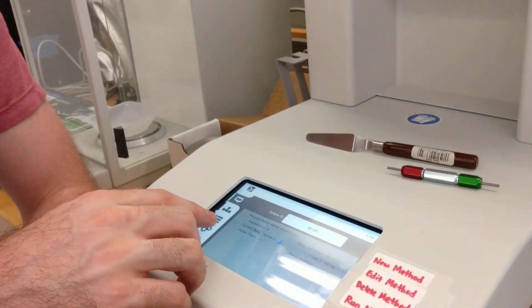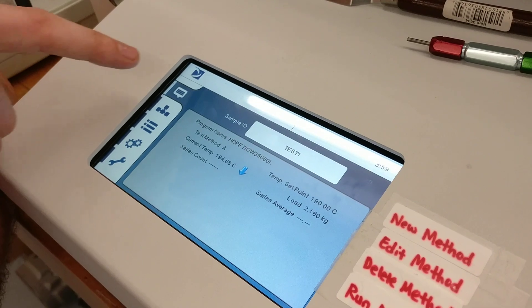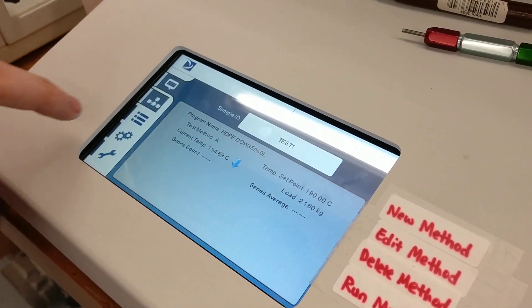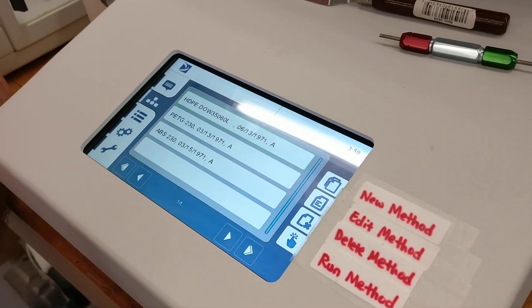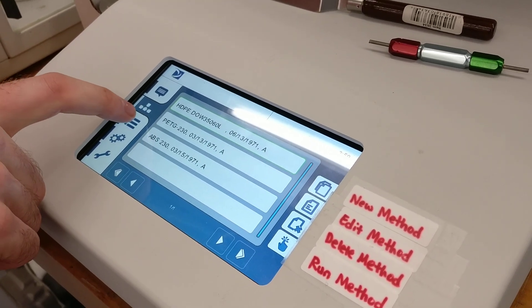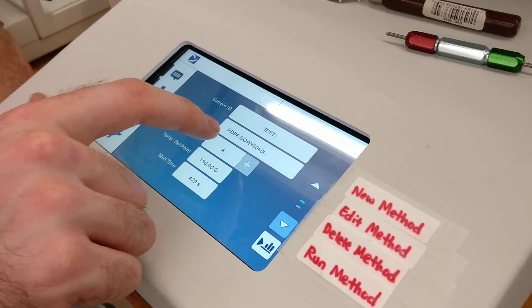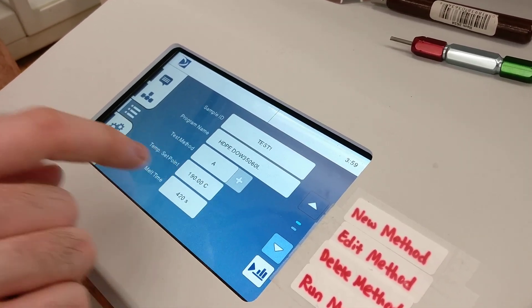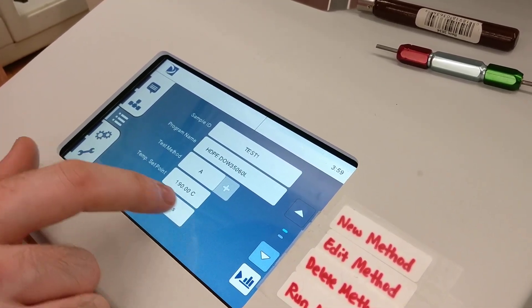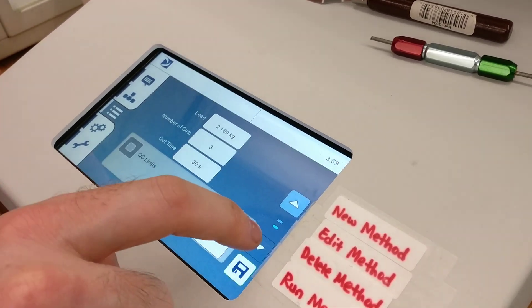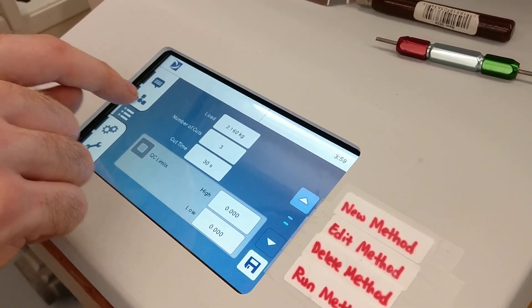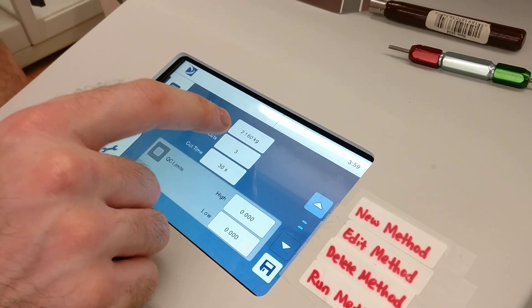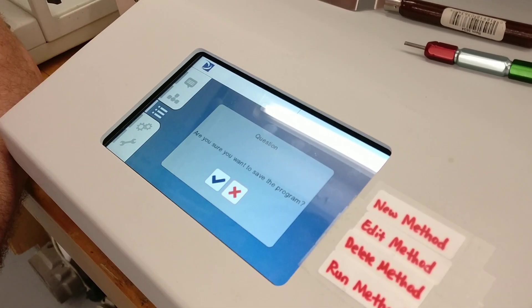You can see what the current temperature is and what the temperature set point is. Go down to the second button and you'll see a list of methods. If you need to make a new one for your plastic, click the third button. You can input a new program name, the set point temperature. The melt time should be around 420 seconds by default. Hit the down arrow, and then the load will be constant, 2.16 kilograms, and then three cuts with 30 seconds each. Then click the save icon here.